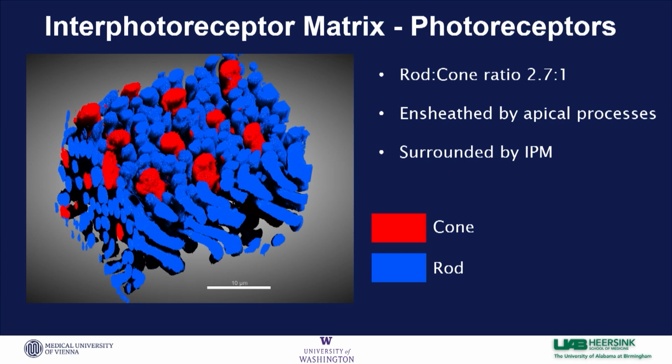Here's a little slide showing the rod and cone ratio. I used some models to segment this, and then manually chose the rods and cones because that would have taken too long to get done by the meeting. But this is basically just showing the ratio, and what we measured in our sample does follow the literature. It's about a 2.7 to 1 ratio of rods to cones.